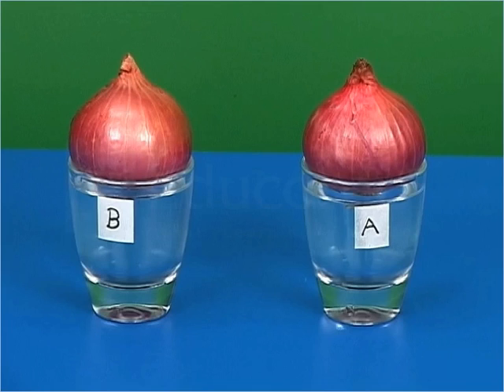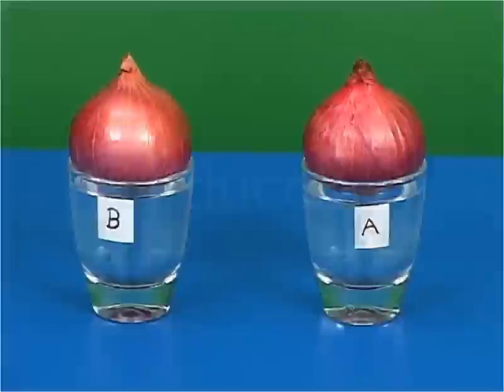After that, leave both the tumblers undisturbed for three to four days. Observe the onion bulbs each day to note the growth of roots.